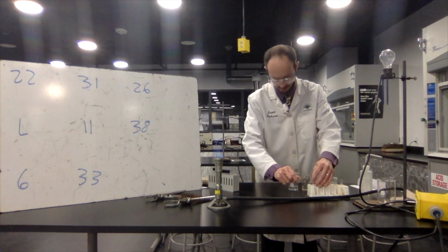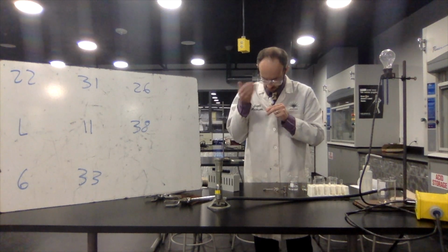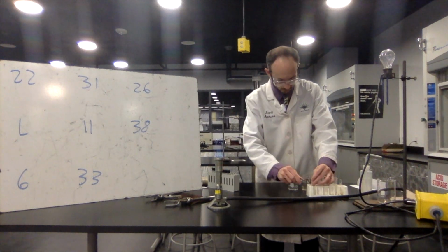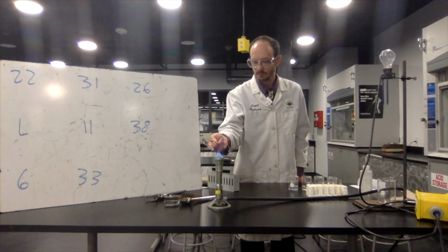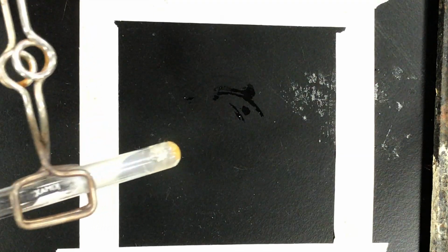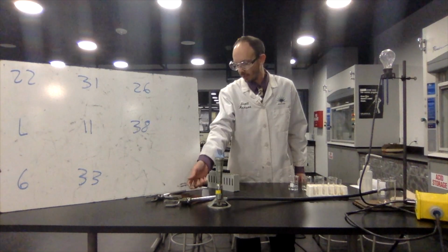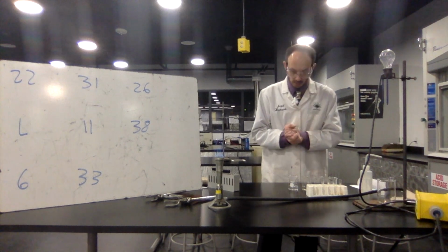Oh, did I tell you? I don't think I did. No discernible scent. No discernible scent. Okay. And now we'll check melting. All right. It's starting to bubble. It's bubbling up the side of the container. It is now liquid. So we are going to call that one a positive test for melting point. Okay? All right, next one.